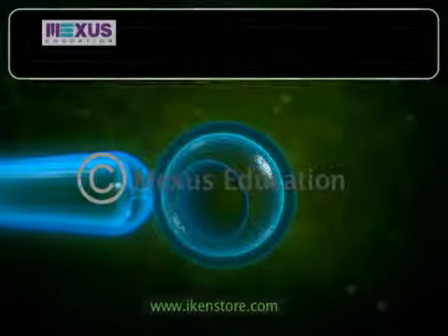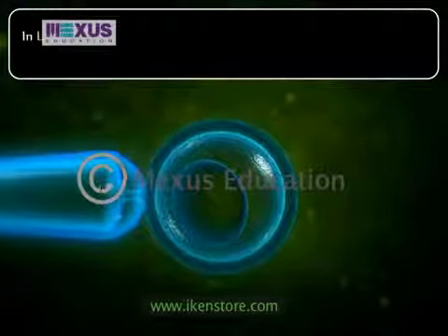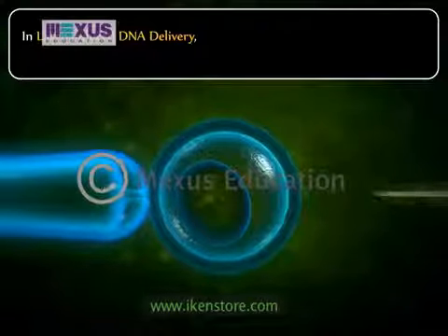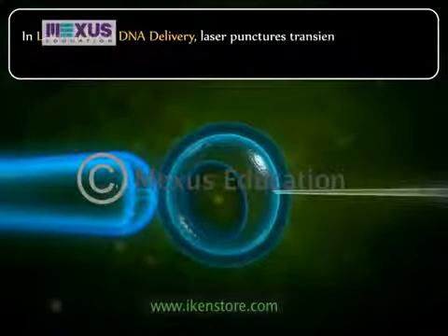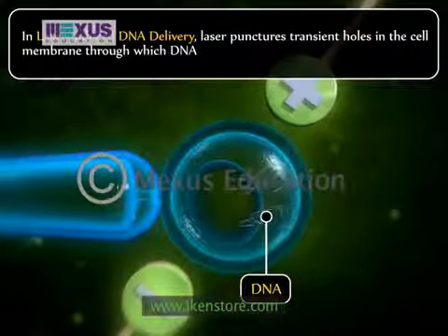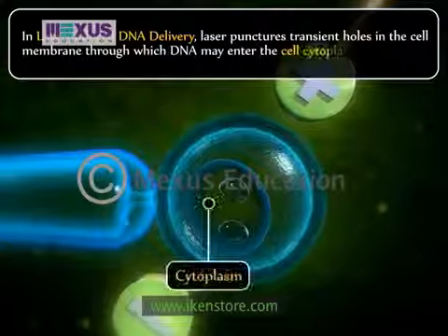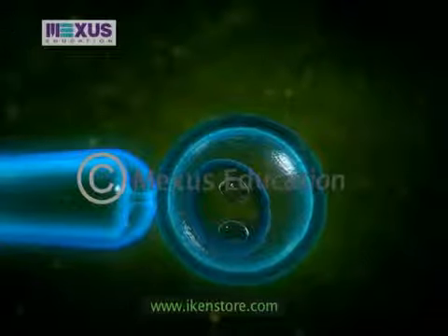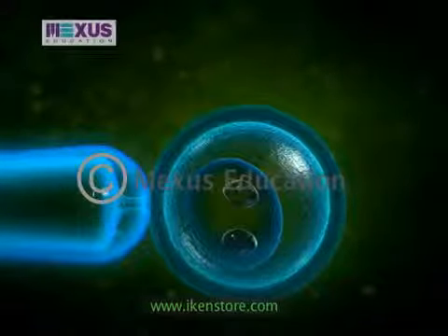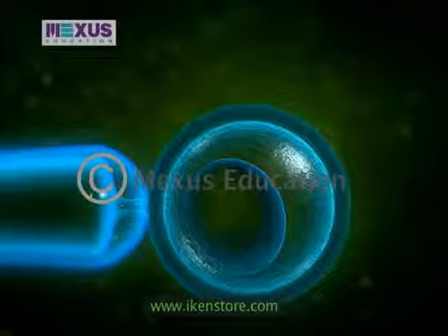The next method is called laser-induced DNA delivery. In this method, laser punctures transient holes in the cell membrane through which DNA may enter the cell cytoplasm. Lasers have been used to deliver DNA into plant cells, but there is no information on stable integration.